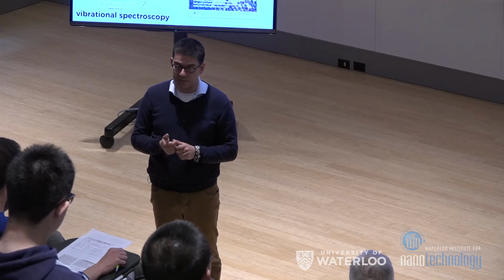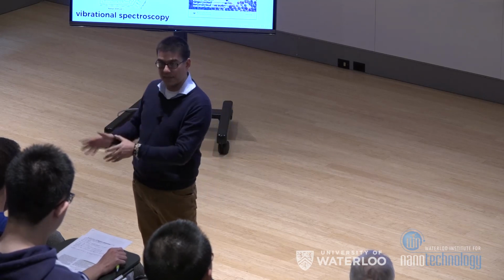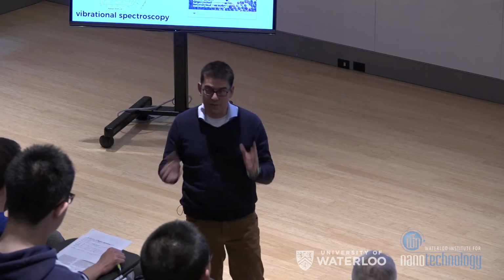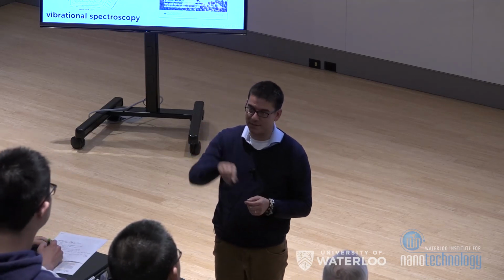The metamodeling, I think, is much more powerful, because in a very small number of experiments, it effectively mimics or reconstructs a very complex parameter space. But we're not experts in this, so we've just really used the tools that we think are available. So it's a combination of all those, if that answers your question. Spell the SNOBFIT? SNOBFIT stands for Stable Noisy Optimization by Branch and Fit. If you look on my website and the paper, which is Lab on a Chip 2007, the details of the algorithm are in that paper. It's a very nice algorithm.